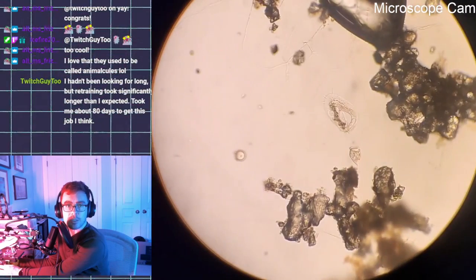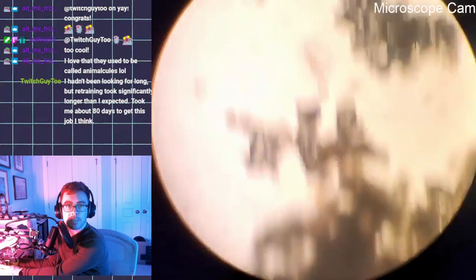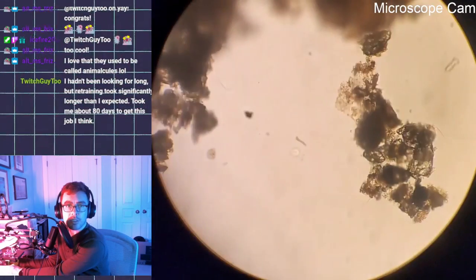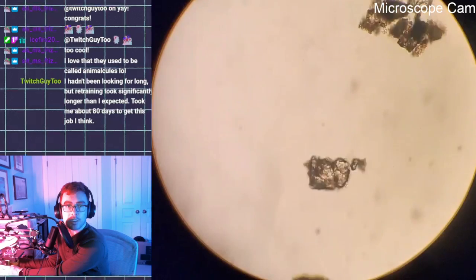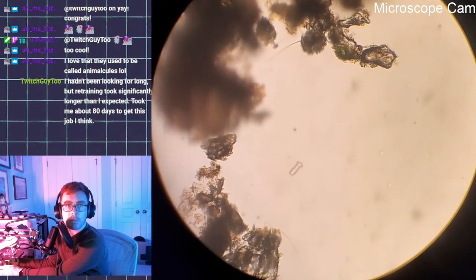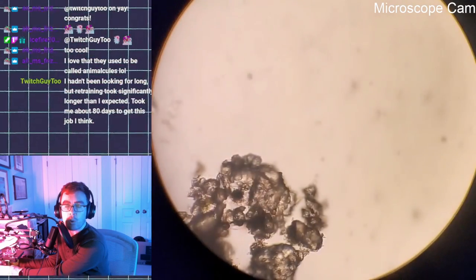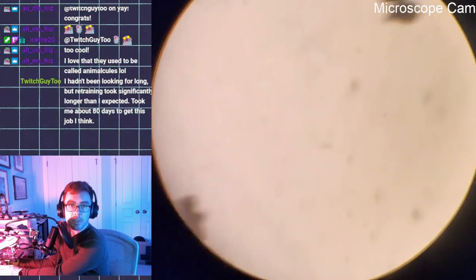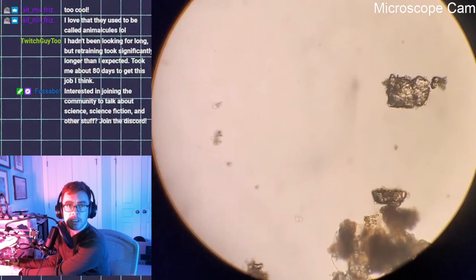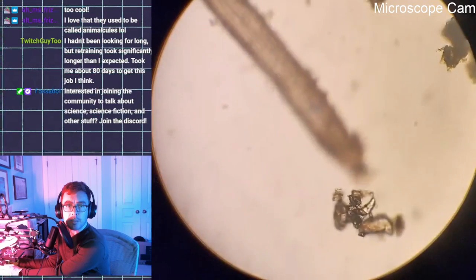Oh, Vorticella just opened back up. I already zoomed out. Still looking for that stentor. Found one stentor so far. I'm only pretty sure it was a stentor. Oh wait, I grabbed all this water because I thought I was picking up bigger things. So I found the copepod, yes. But I also thought there's going to be some other things in here.